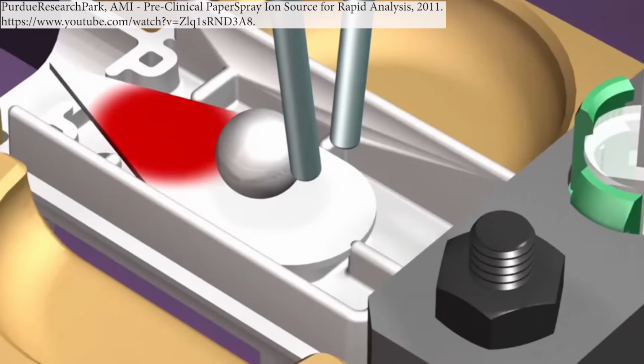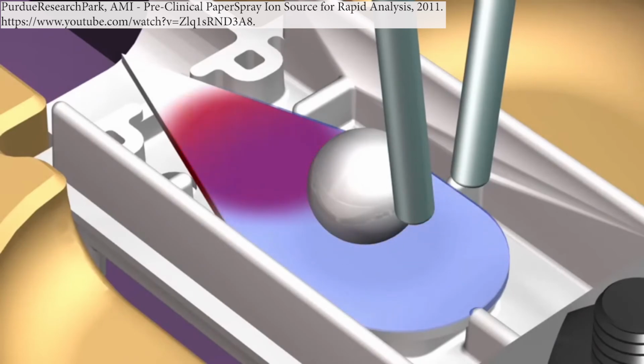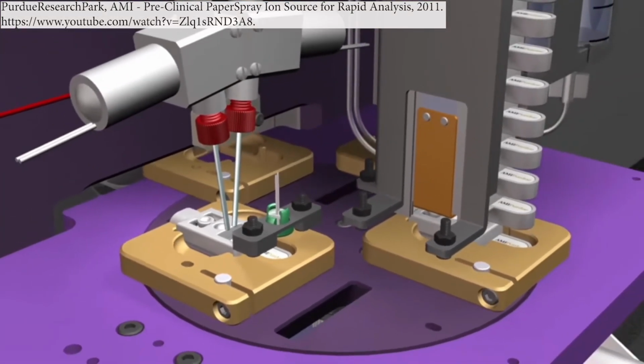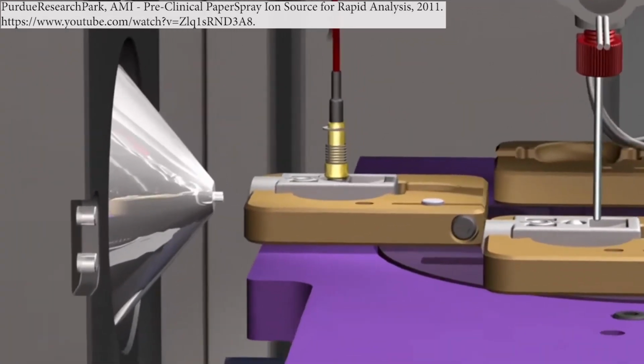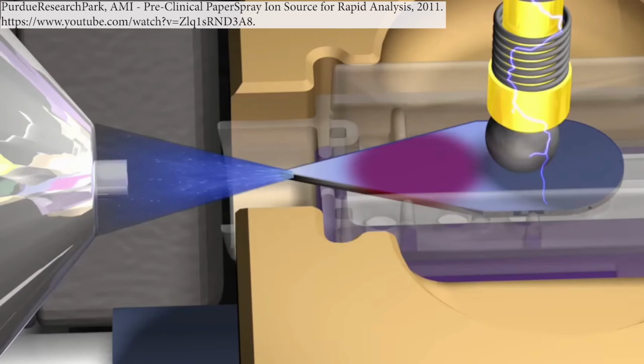this paper, and then what they're going to do is they're going to deposit some solvent at the base of the paper, and that solvent is going to wick up the paper. And it's going to extract some of the blood components and bring that up towards the front there. Now, you don't have to have this big fancy instrument. This is an instrument they propose, but that's a high voltage cable they've got there. And what they're going to do is they're going to make high voltage contact with the paper, and it turns out you can electrospray directly from the paper, which is pretty remarkable. So they're electrospraying directly from this filter paper, and that's going to do an electrospray mechanism where you produce gas phase ions off the stuff that was in the blood.